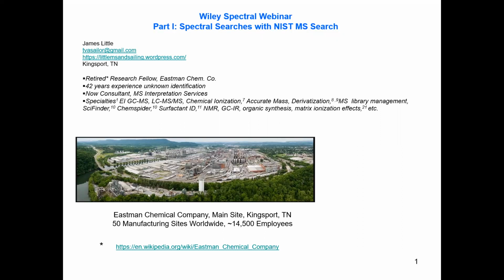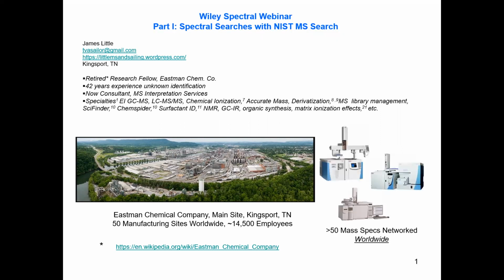Eastman Chemical Company has its main site in Kingsport, Tennessee, where I work. There are about 50 manufacturing sites worldwide with 14,000 employees. But the most important thing with regard to this seminar is that we had 50 mass specs that were networked worldwide, where we shared files and expertise. We used mainly the NIST search for our GCMS, for identifying compounds and also for archiving our information to share with others on the network in user libraries.